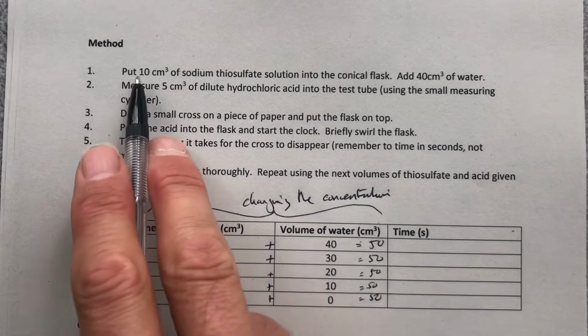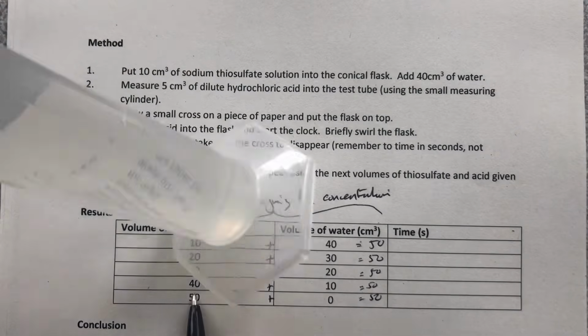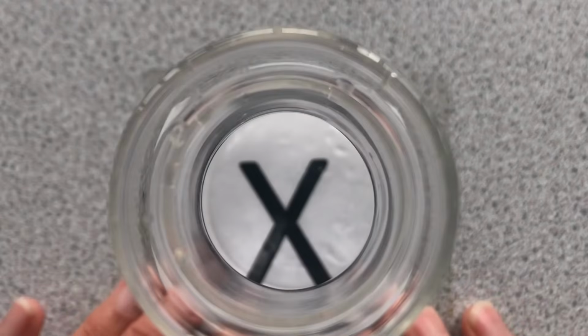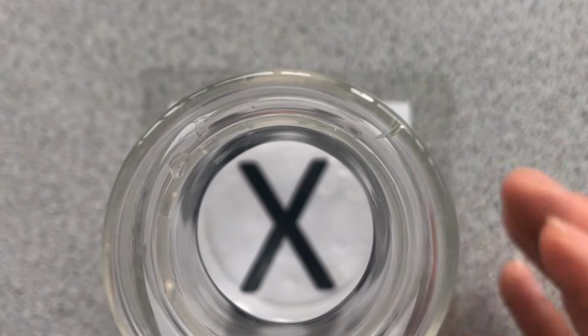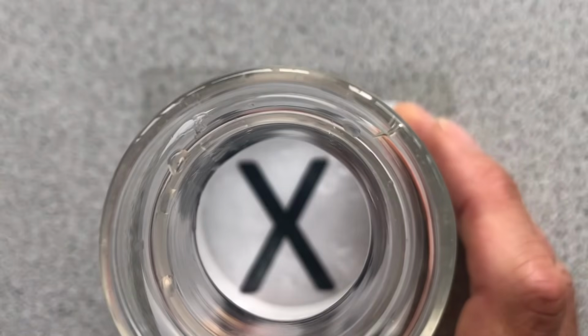Okay, so instead of measuring out 10 centimetre cubed, we're measuring out 50 centimetre cubed of sodium thiosulfate. And I've already done that, and that's in this measuring cylinder here. We use measuring cylinders to measure out. And I've got my 5 centimetre cubed of acid in a smaller measuring cylinder there. So let's just move the method out of the way, and let's bring our conical flask. Got our conical flask here, and we're going to put it on an X there, and let's put them in. So first off, I'm going to put my 50 centimetre cubed of sodium thiosulfate solution in. That's neat, so I haven't diluted it any further.